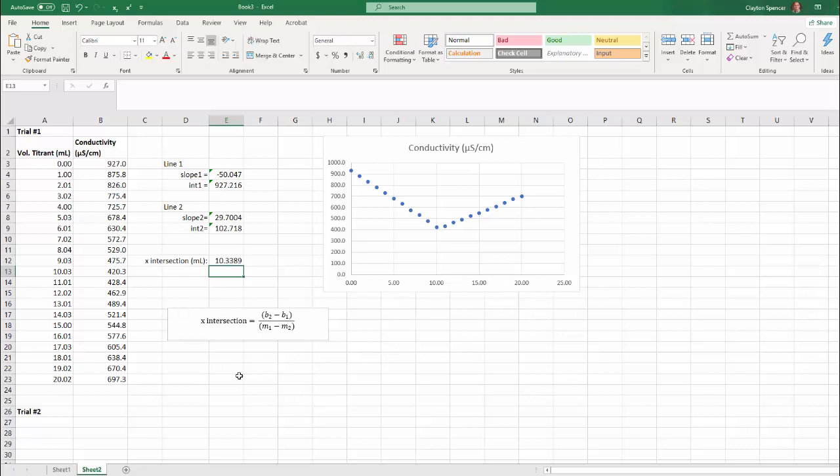Okay, so then I can do my molarity calculations, and I'm going to start off with that number. So the chloride molarity, I can type in a formula to do that. And so it's going to be the milliliters, you'll remember from our last equation, times the concentration of my silver nitrate solution, 0.07. Now, you should use the more precise value that you know. It will probably be somewhere around 0.07, but it'll be 0.07034 or whatever it happens to be. So use your precisely calculated value.